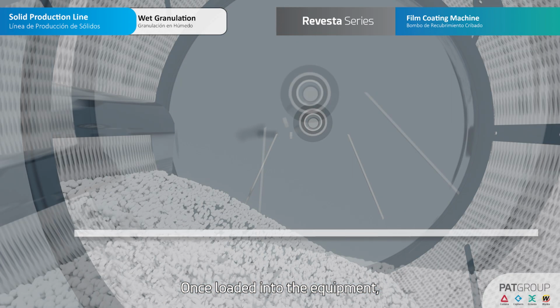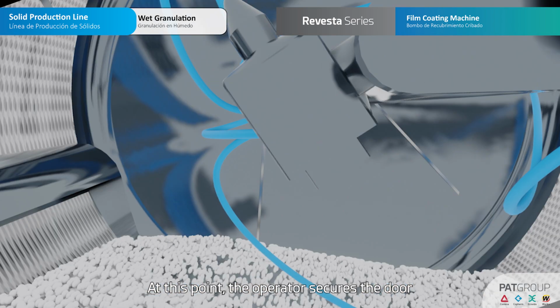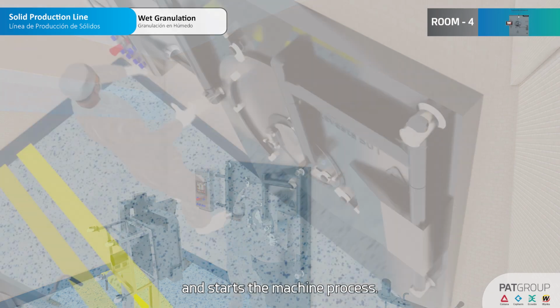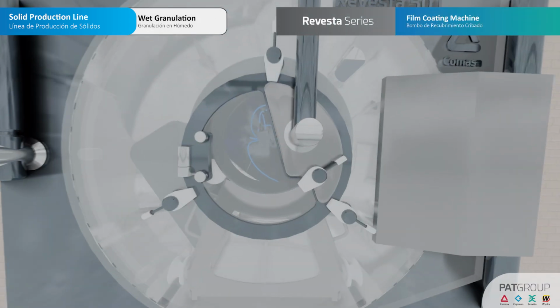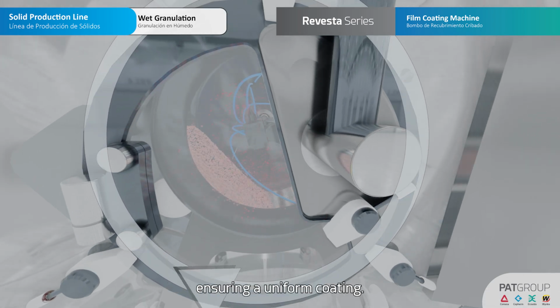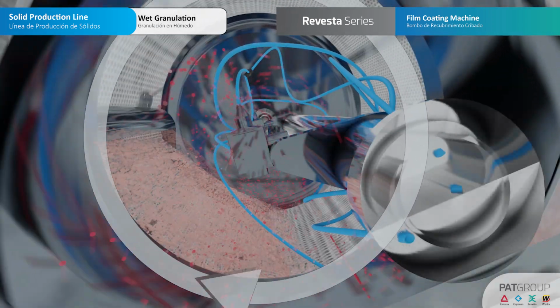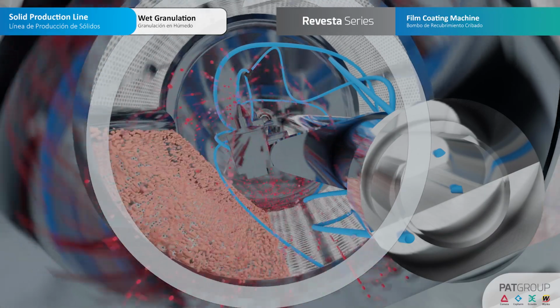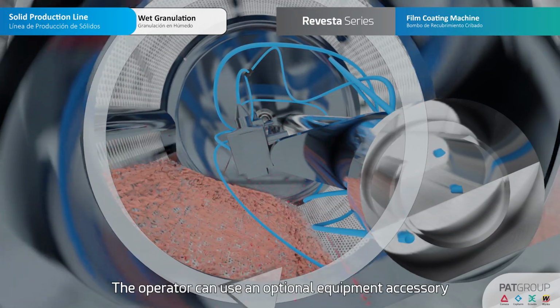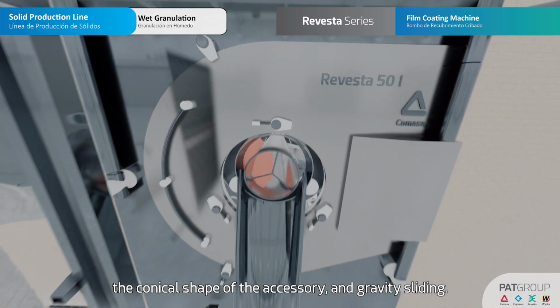Once loaded into the equipment, the tablets should rest horizontally. At this point, the operator secures the door and starts the machine process. The container rotates in a tablet cascade while the spray gun injects the lacquer, ensuring a uniform coating. The operator can use an optional equipment accessory to facilitate unloading. Unloading occurs by rotating the drum, the conical shape of the accessory, and gravity sliding.